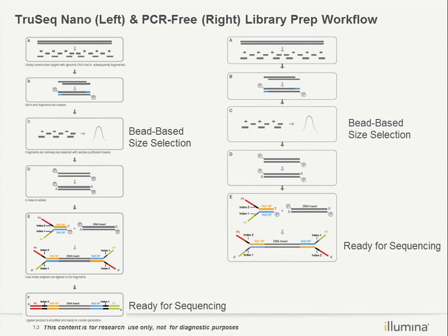the DNA insert here. And for the nano kit, we need to go through 8 cycles of PCR to amplify our DNA fragment. Now after the normalization and the quantification, we can get the library ready for sequencing. So it's a brief workflow of the nano kit.